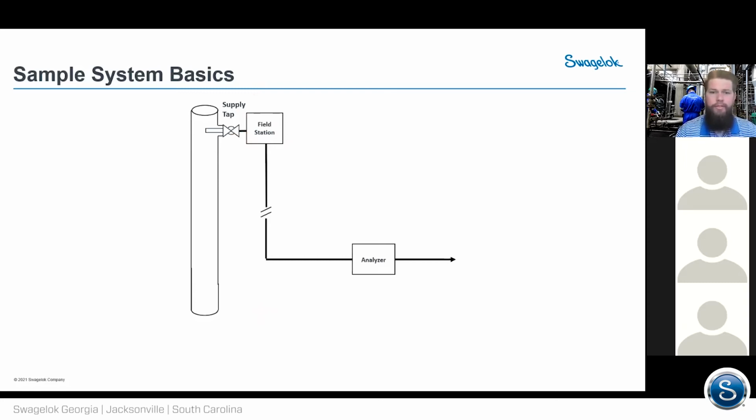And this is going to be able to flow your gas to the analyzer as fast as possible, right? This is going to increase your velocities. You're flowing less gas molecules, therefore increasing the velocity of the gas when you're decreasing that pressure. So this would be a typical installation in the field station.